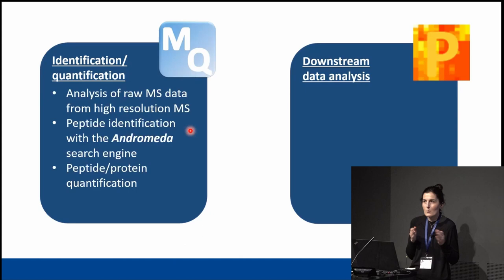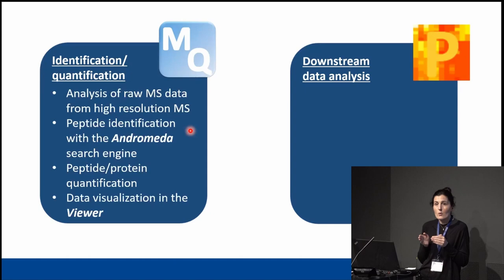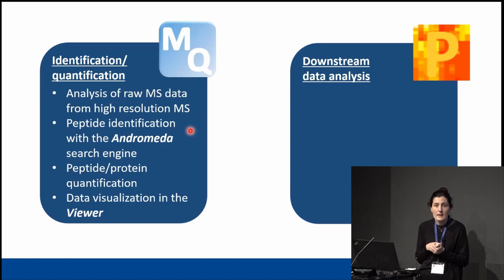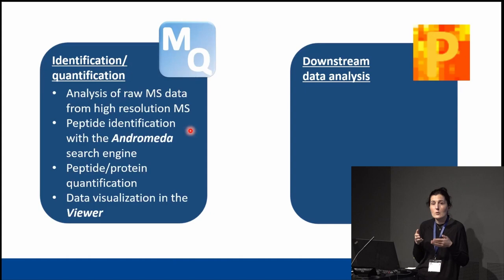We have a specific presentation about the output tables because it's quite important — it's what you get from MaxQuant and you should understand which table is which. Another nice feature in MaxQuant is the viewer. Even before you run your raw files, you can go to the viewer and see the spectra there. They're not annotated yet because you haven't run MaxQuant, but you can see all the spectra. Then after MaxQuant finishes running, you can go back to the viewer and see the identified, annotated spectra.